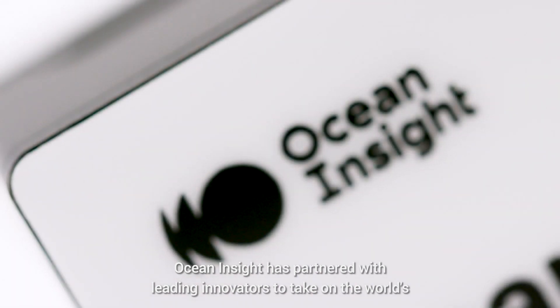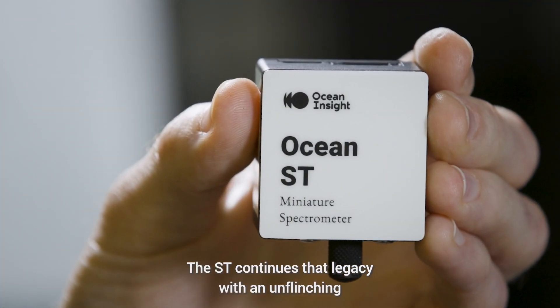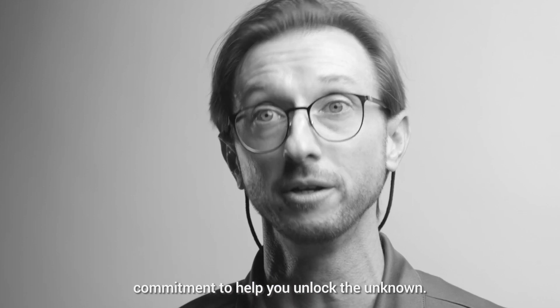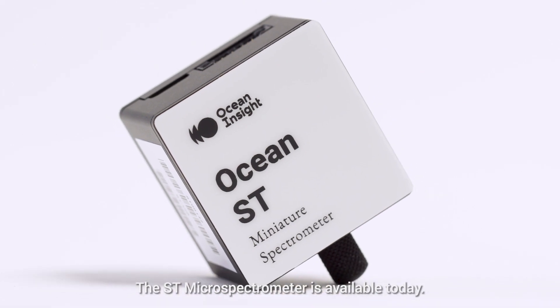For more than 30 years, OceanInsight has partnered with leading innovators to take on the world's biggest challenges using modular spectroscopy. The ST continues that legacy with an unflinching commitment to help you unlock the unknown. The only limitations are your imagination. The ST microspectrometer is available today.